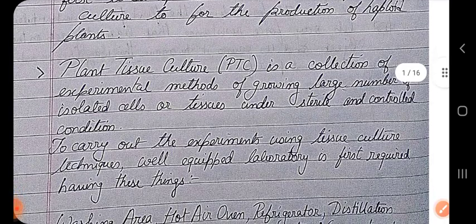So I have said what plant tissue culture is. Plant tissue culture is a collection of experimental methods that help us to grow a large number of isolated cells or tissue under sterile and controlled conditions. Okay, what type of sterilization is needed? Obviously it's a very aseptic condition.